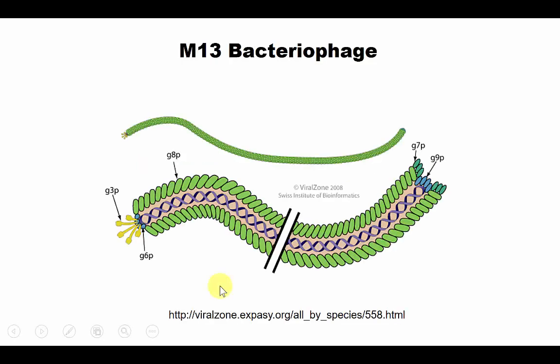Now let's think about the biological library. This is the famous bacteriophage M13. M13 has different coat proteins, and one of them we can utilize, let's say P3 here, and we can attach those antibody-like proteins expressed on here, and then utilize this as a high-throughput screening system. This approach we call phage display.